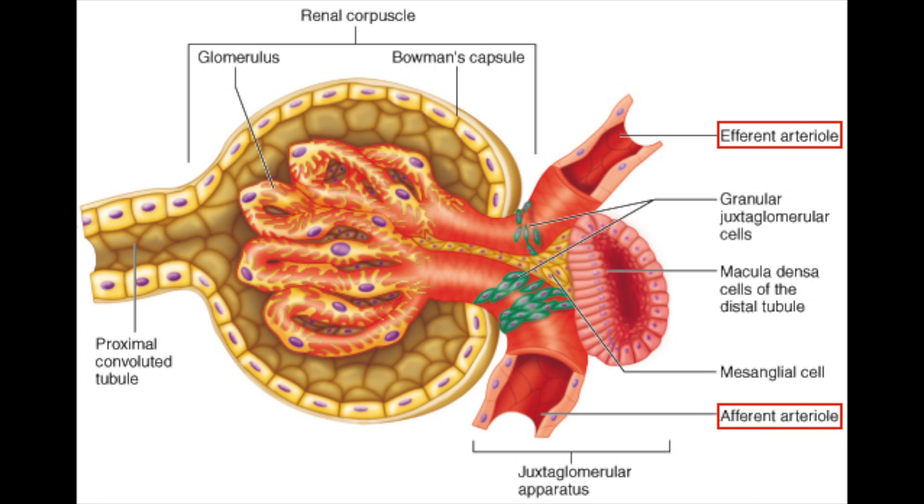At the vascular pole, we can see afferent and efferent arterioles, though they are difficult to distinguish and not readily seen. Blood enters the glomerulus through the afferent arteriole and exits through the efferent arteriole, which then goes on to supply the tubules of the nephron.